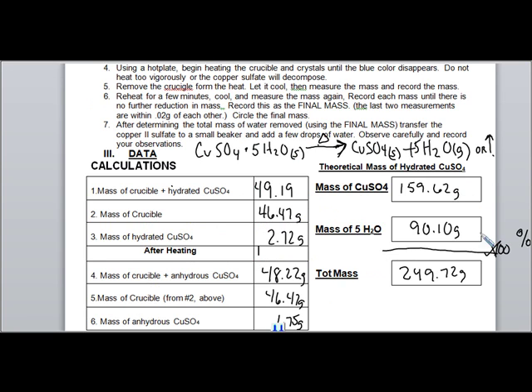Now, you calculate this percentage to be what? This is 1 mole of copper 2 sulfate pentahydrate. This is the equation showing you exactly what's happening here. 1 mole of copper 2 sulfate pentahydrate, that's what the "penta" refers to, that 5, is heated, and the copper 2 sulfate separates from the water molecules, right?